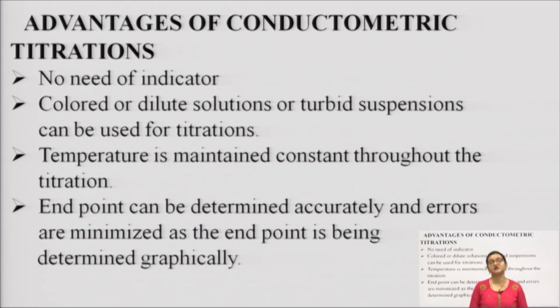It is determined graphically, which is a very positive point. If any errors occur, we can remove or calibrate them with the help of the graph which is plotted.